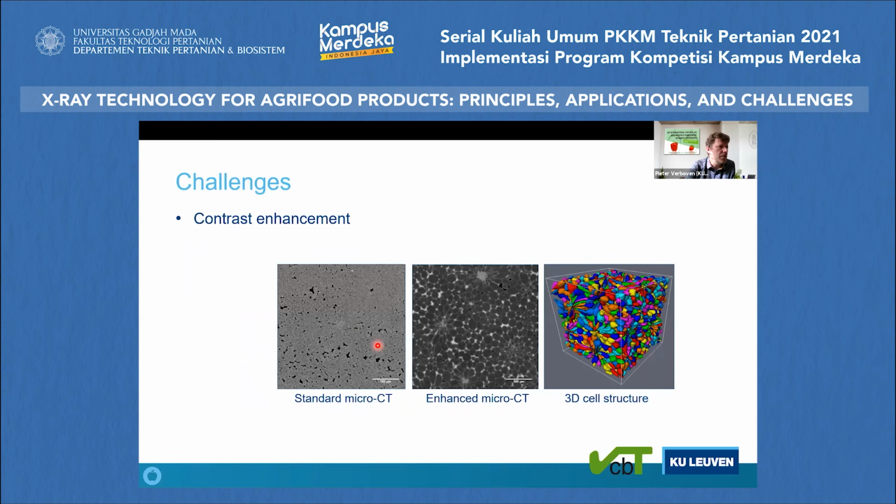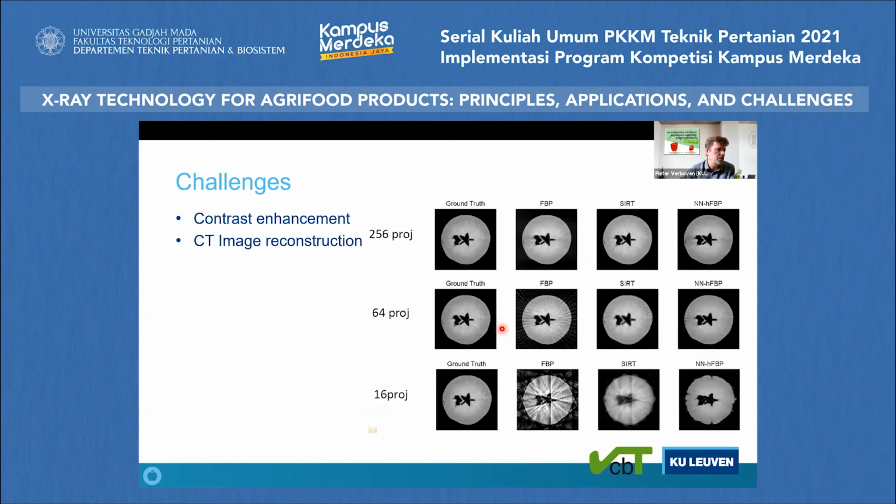Finally, there are still some challenges. X-ray, I've talked about it, that it is a fantastic method, but it's not always the case. You can have contrast issues. Image might be very blurry. It may not give any very useful information beyond that there are pores in these tissues, but not much more. You could use enhanced micro-CT using contrast agents. You get much more details of the structure. These are challenges to deal with.